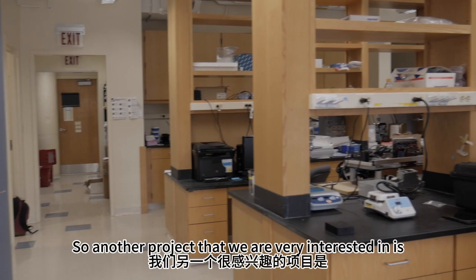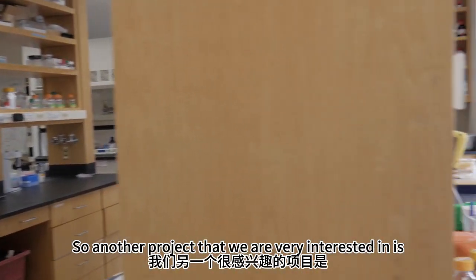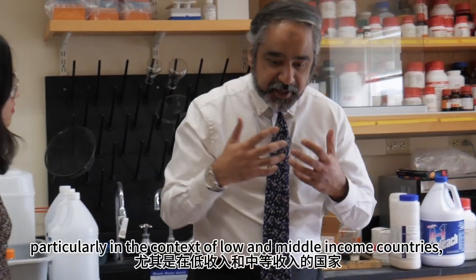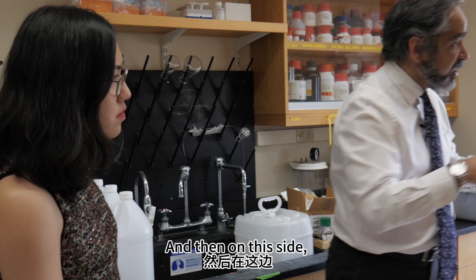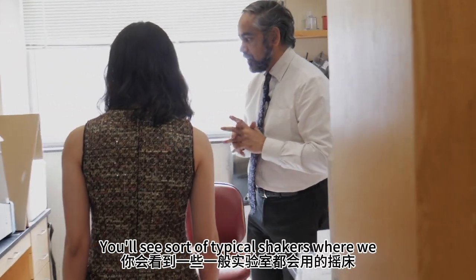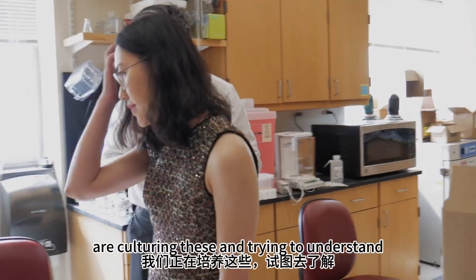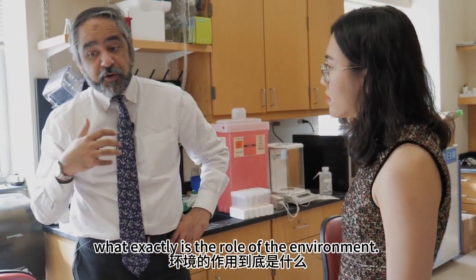Yeah, so another project that we are very interested in is antimicrobial resistance, particularly in the context of low and middle income countries. On this side, you'll see typical shakers where we are culturing these and trying to understand what exactly is the role of the environment.